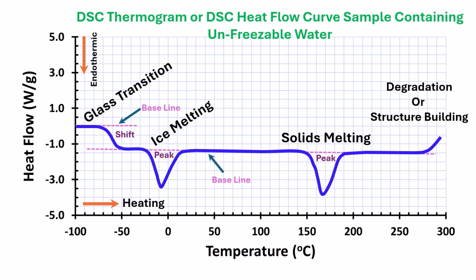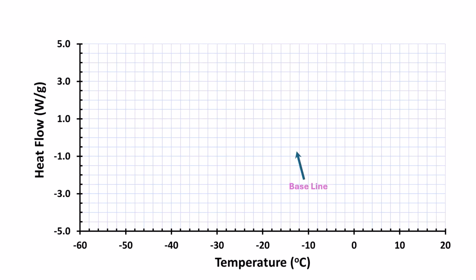Now we know the fresh apple slice contains freezable water since we observe an ice melting endotherm, and we need to follow a specific procedure as I am going to discuss next. Most commonly, the ice melting endotherm is considered a reversible process, thus melting is just opposite to the freezing, and then freezing characteristics could be determined from the ice melting endotherm. This is due to a lag period during cooling of the sample.